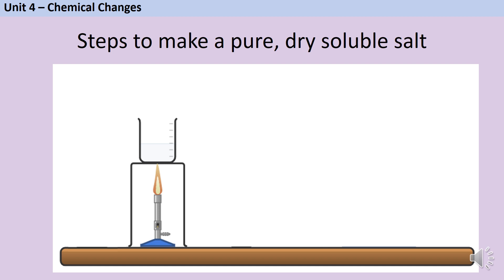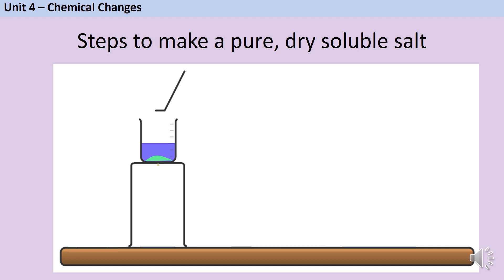Once it's at a suitable temperature, I would turn off the Bunsen burner and add an excess of a suitable base — in this instance, either copper oxide or copper carbonate. When I say I add an excess, I mean I'm going to add too much. The reason for this is to make sure that all of the acid reacts. I want the reactant that's in excess to be the one that's easy to get rid of. Getting rid of too much acid would be really challenging, but getting rid of too much base I can just filter out afterwards. Here I've added my excess copper carbonate and you can see it's in excess because there's still some left on the bottom of the beaker — the last bit can't react.